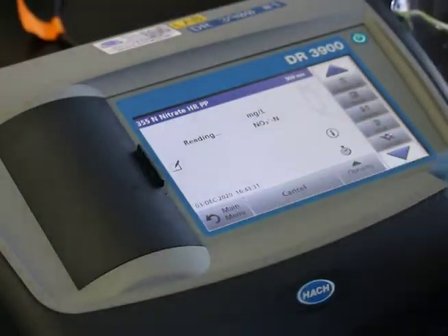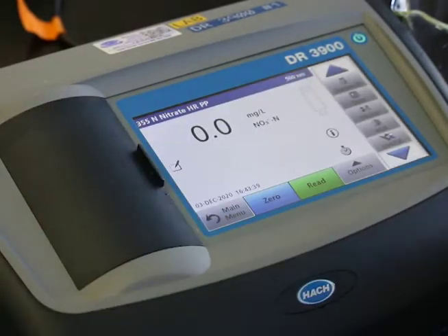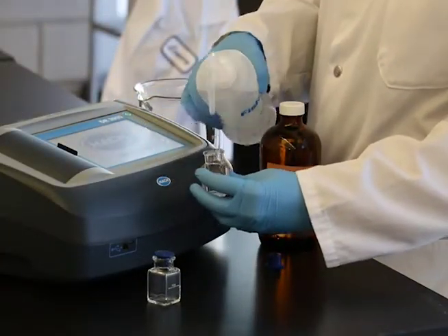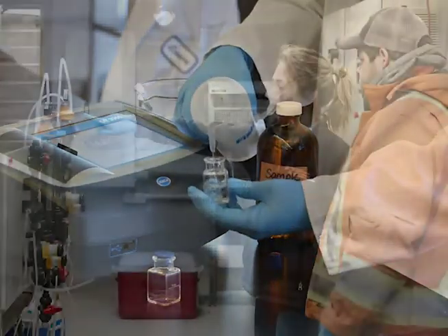Press read and record your results. For the best results, measure the reagent blank value by replacing the sample with deionized water in the procedure. The value obtained can be subtracted from the sample results.